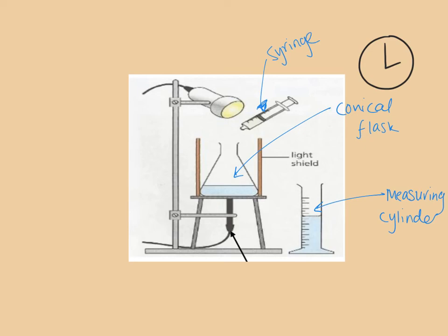And we've got some light shields either side. So this is our light source. So this is a lamp. You can call it a light source. Hopefully you know what this is. This is a tripod.